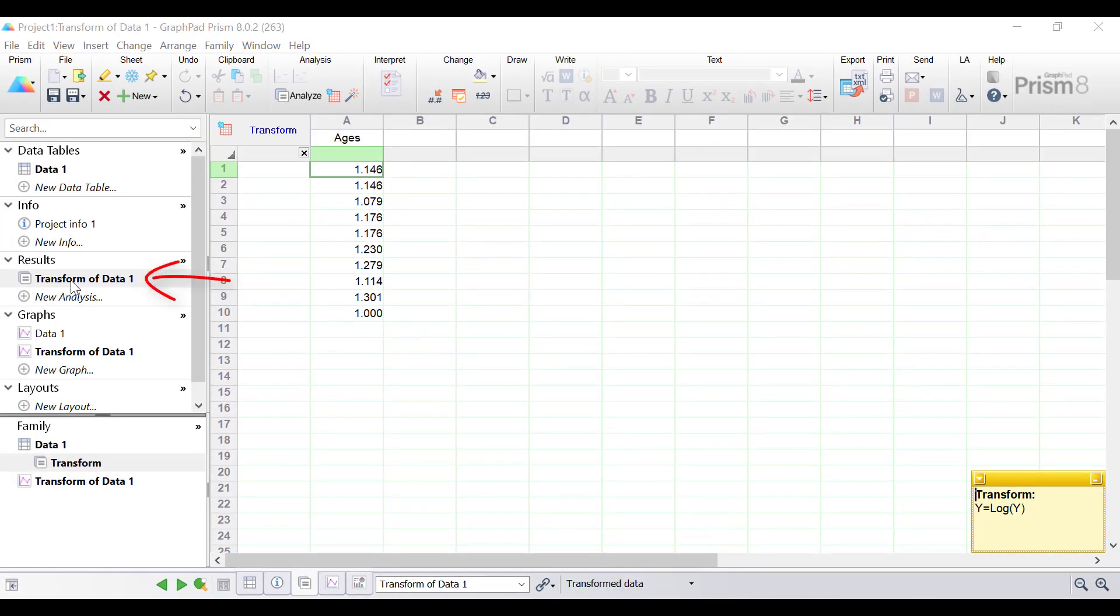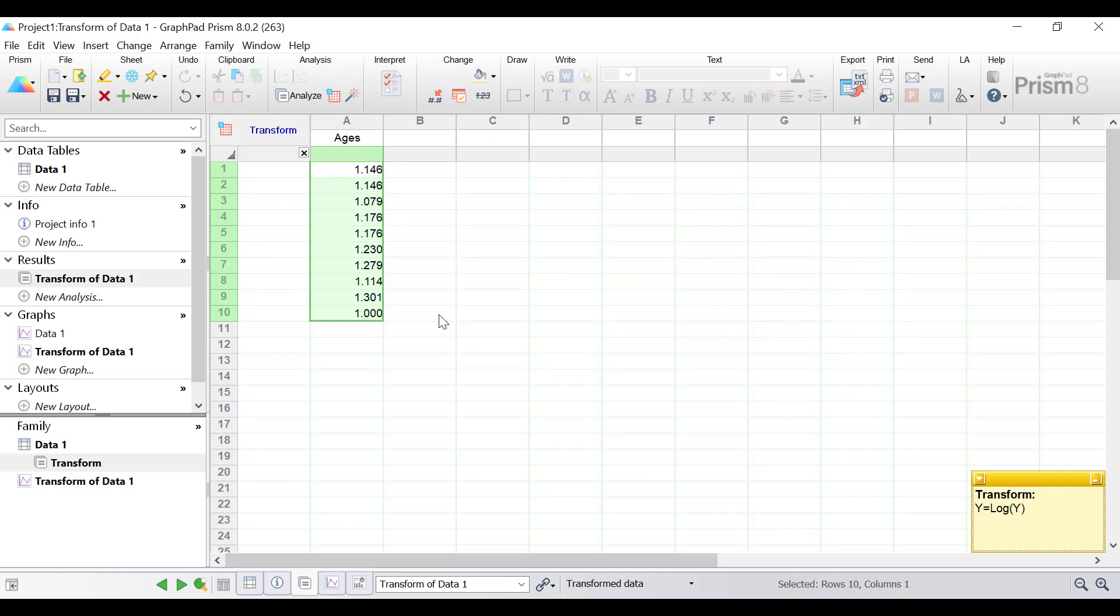This is called transform of your data sheet and contains the log to the base 10 transform data from the original values.